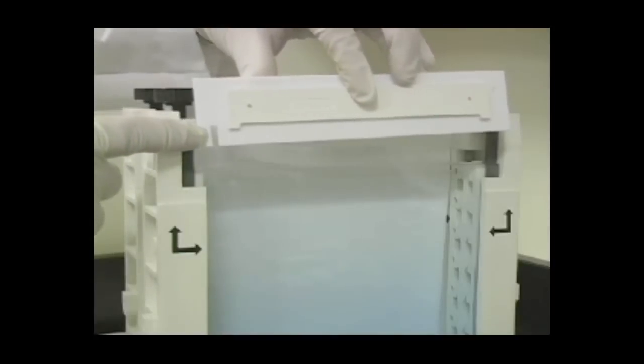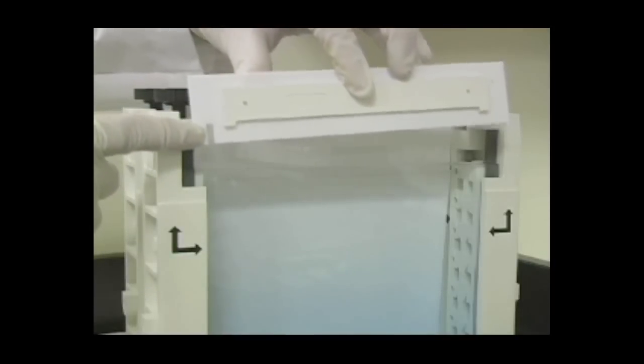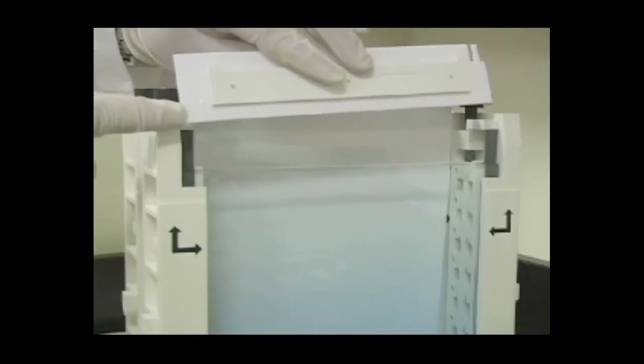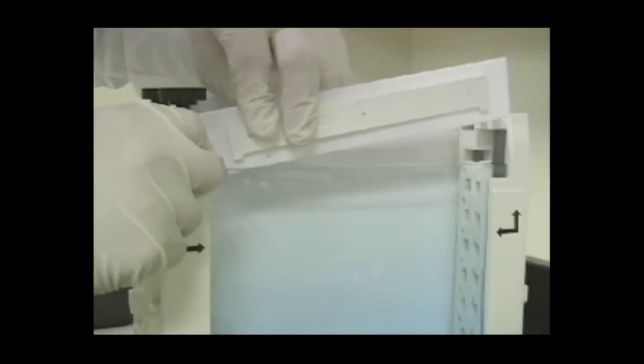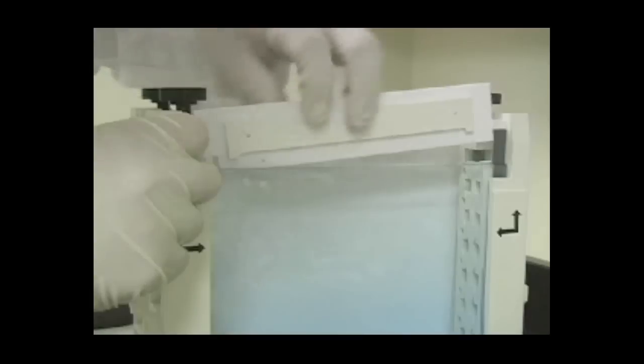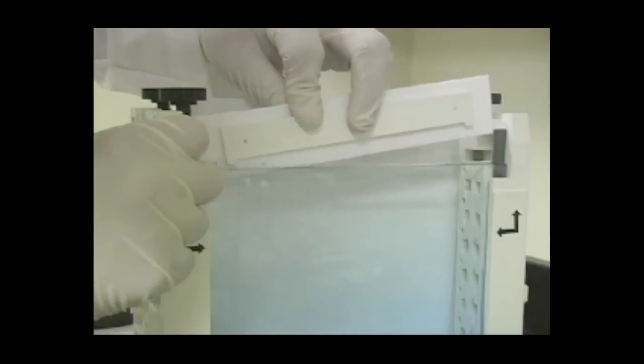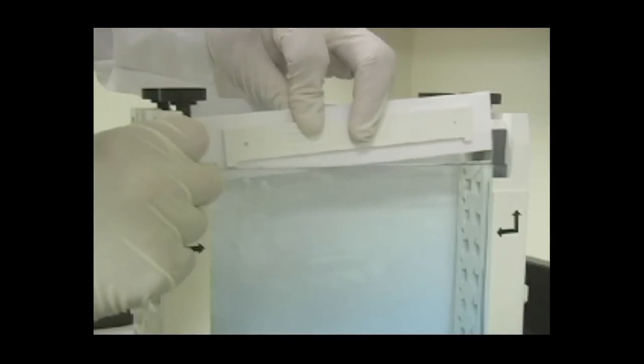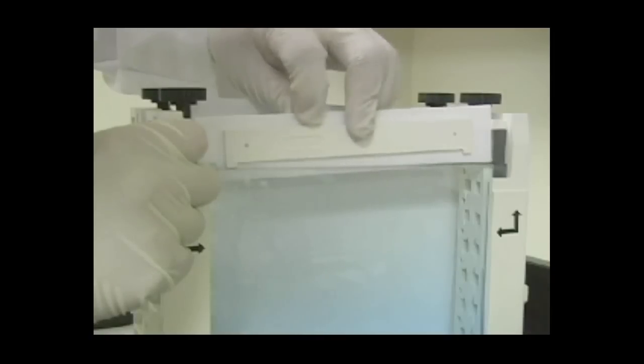The IPG comb has two sides, one with a reference wall for standards and one without. The side without the standard lane allows for commercially available 18 cm strips to be used without trimming. The side with the end reference wall allows standards to be run alongside your sample, but an 18 cm IPG strip will need to be trimmed to fit into the smaller prep well.